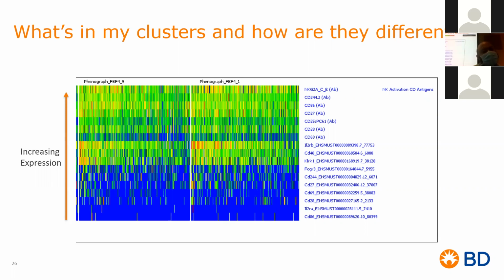If you look at this, would you say that these are different? Probably not. This is what I mean: not everything that clusters out informatically is biologically relevant. I would actually merge these 2 clusters together and make only 1 cluster. And I would challenge someone to tell me that I couldn't do that. So when we get data from other people analyzed, we need to ask ourselves, are these data making sense? Do these data mean anything biologically, or is this just an artifact from mathematics? So please take the time to really scrutinize your own data.